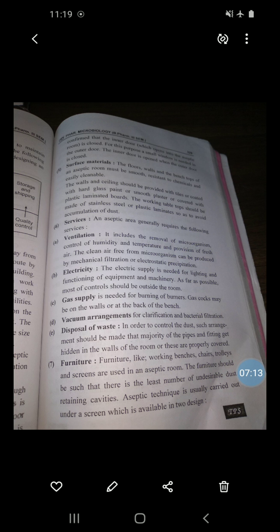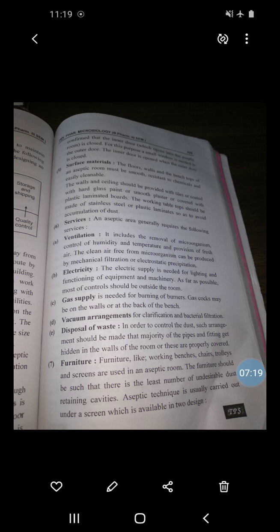The walls and ceiling should be provided with tiles or coated with hard glass paint or smooth plaster, or covered with plastic laminated boards.